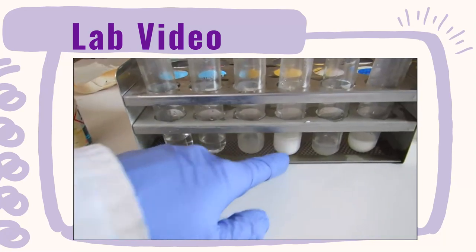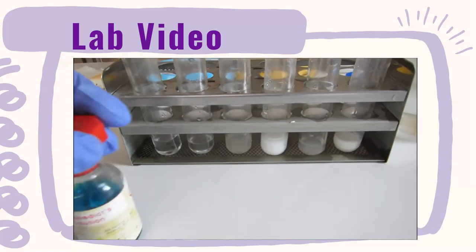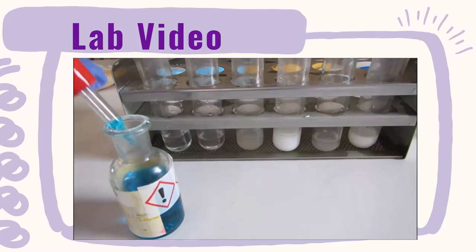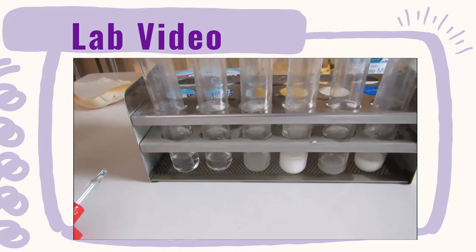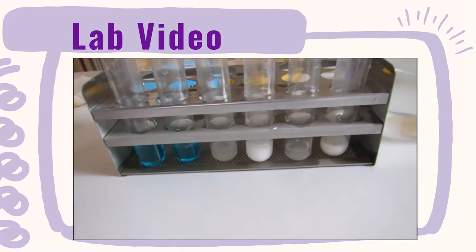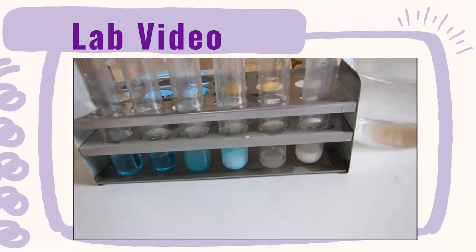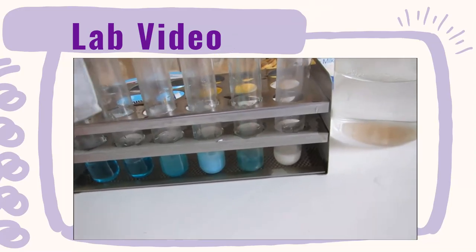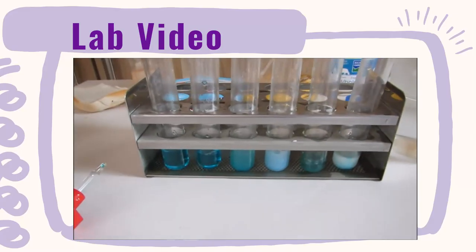So the final food test is for reducing sugars. As before, I put deionized water as my negative control. My positive control is in the second tube, and this time it is a glucose standard. Then I have my bread, cheese spread, banana, and milk. For the reducing sugars, I'm going to add some Benedict's solution to all of them.